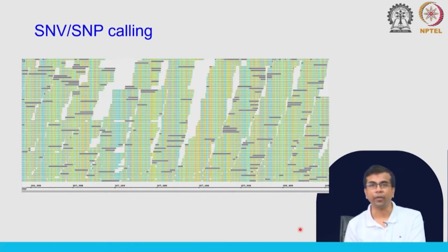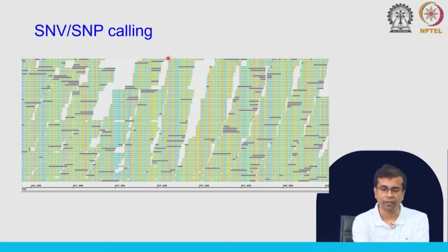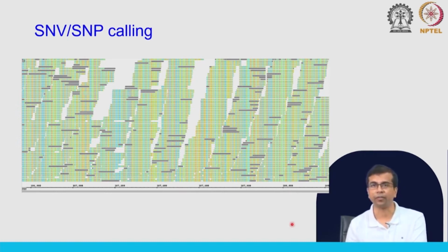What are the steps for SNP calling? Here is an image of the reference genome against which we have aligned these reads. We have done this using the integrated genome browser, which we will again use later on in the hands on. Each fragment is a read that has been mapped against the reference genome, and the reference genome coordinates are given at the bottom. Certain regions are in gray because they are not aligned; these are soft clip regions.